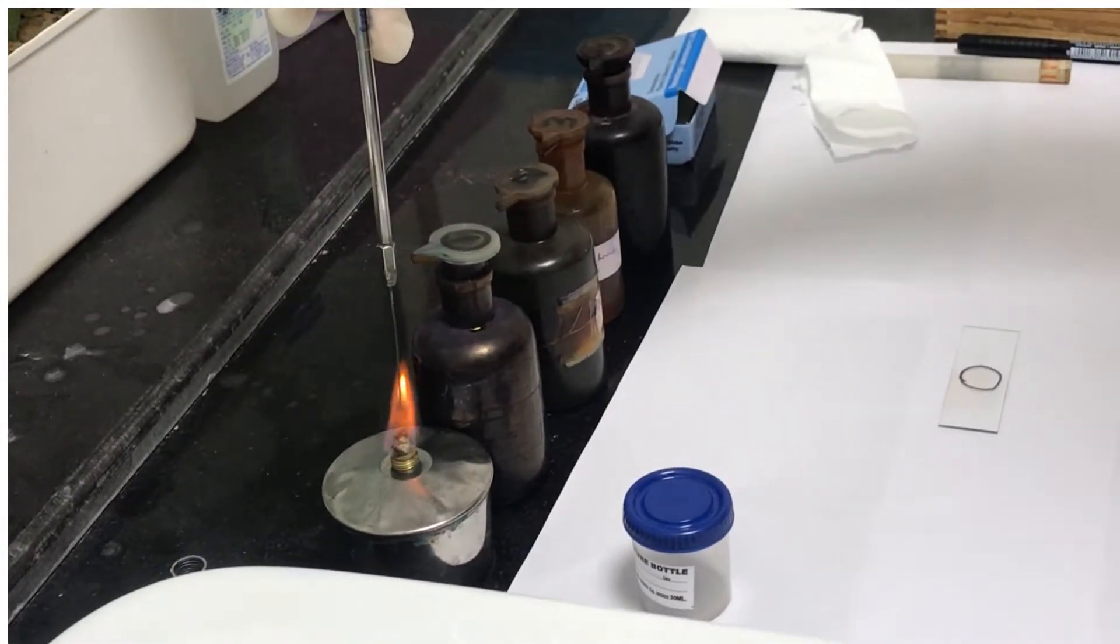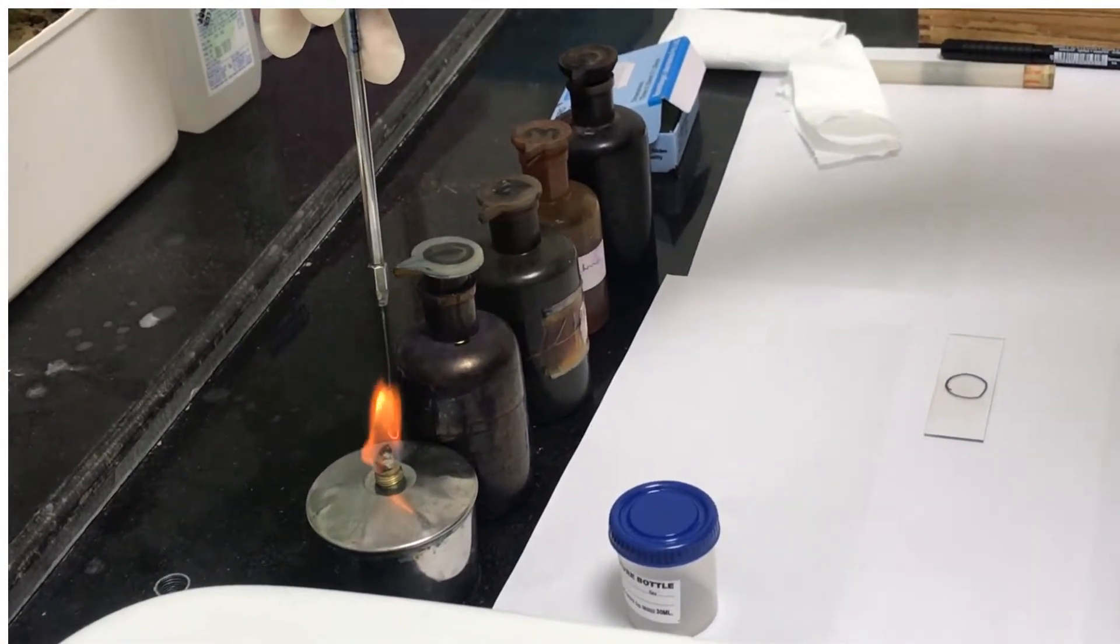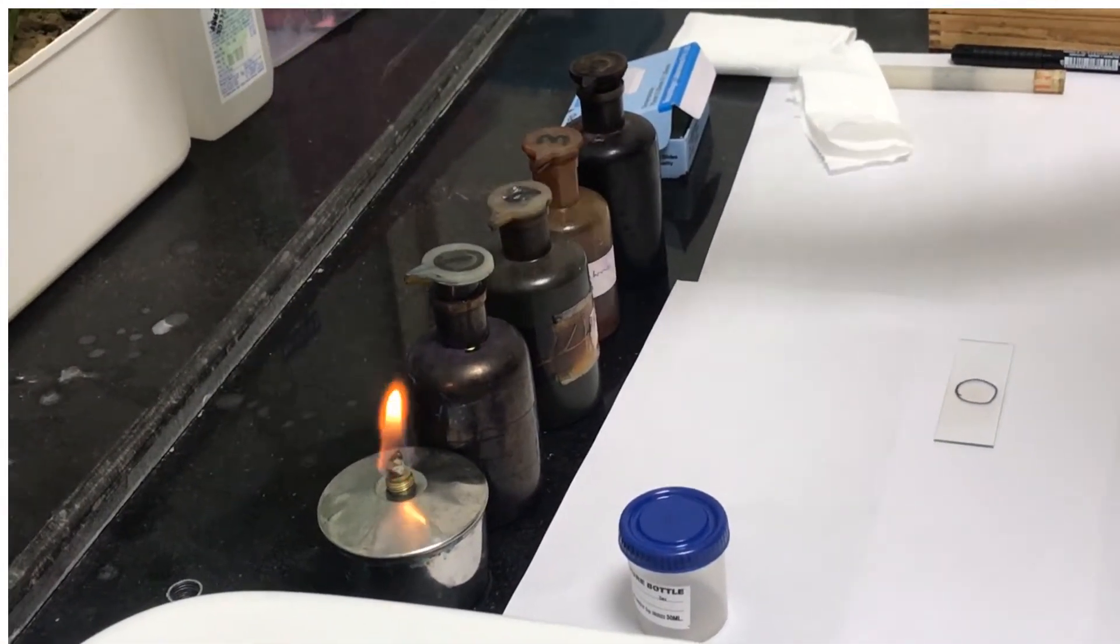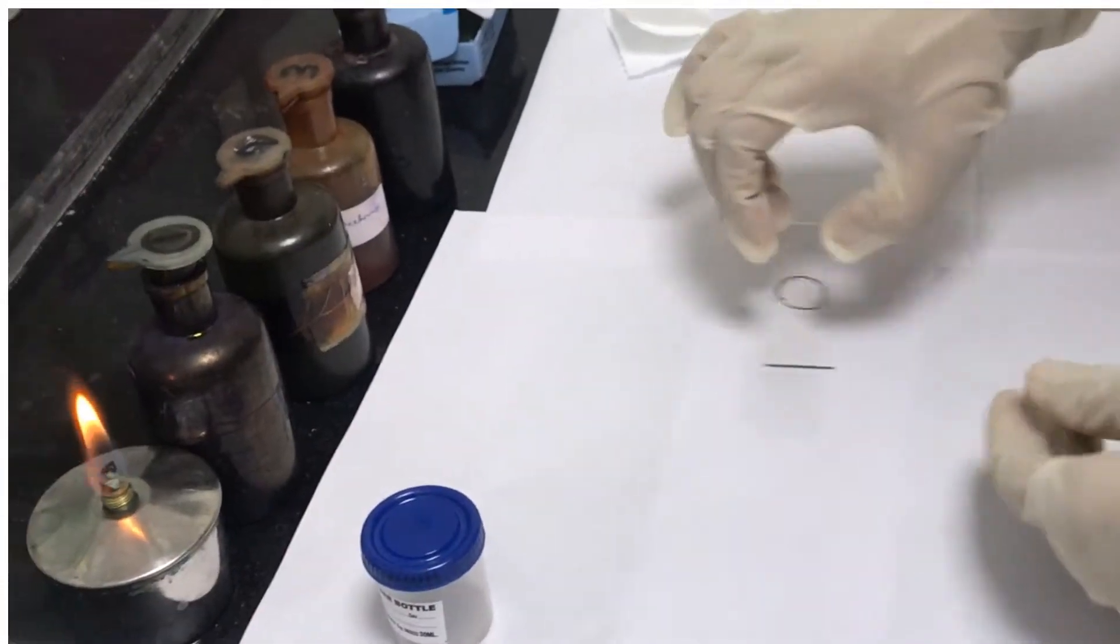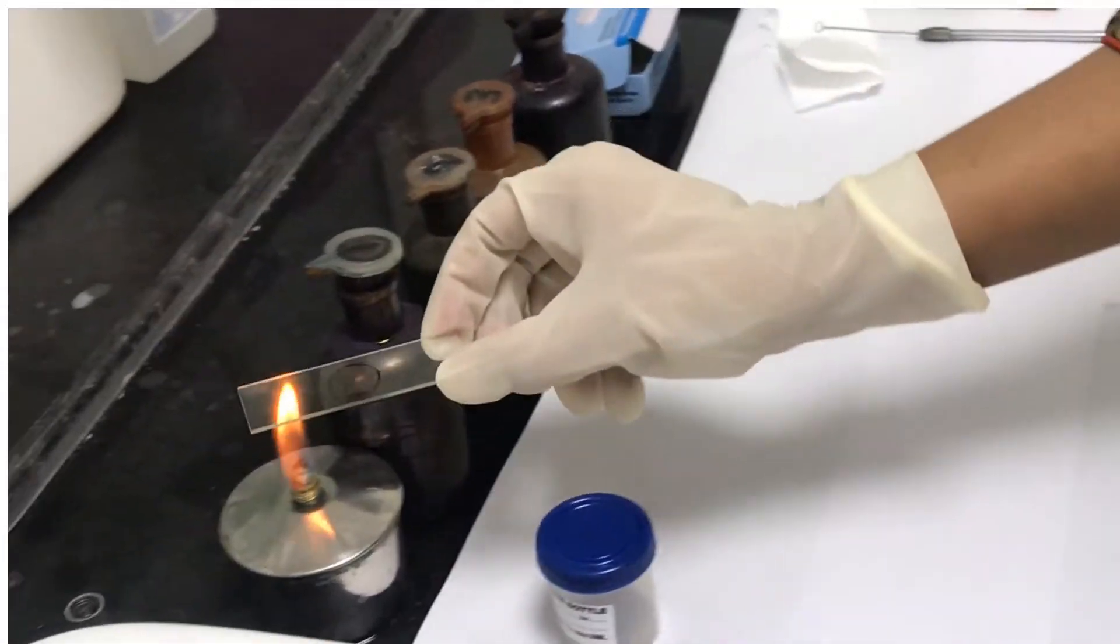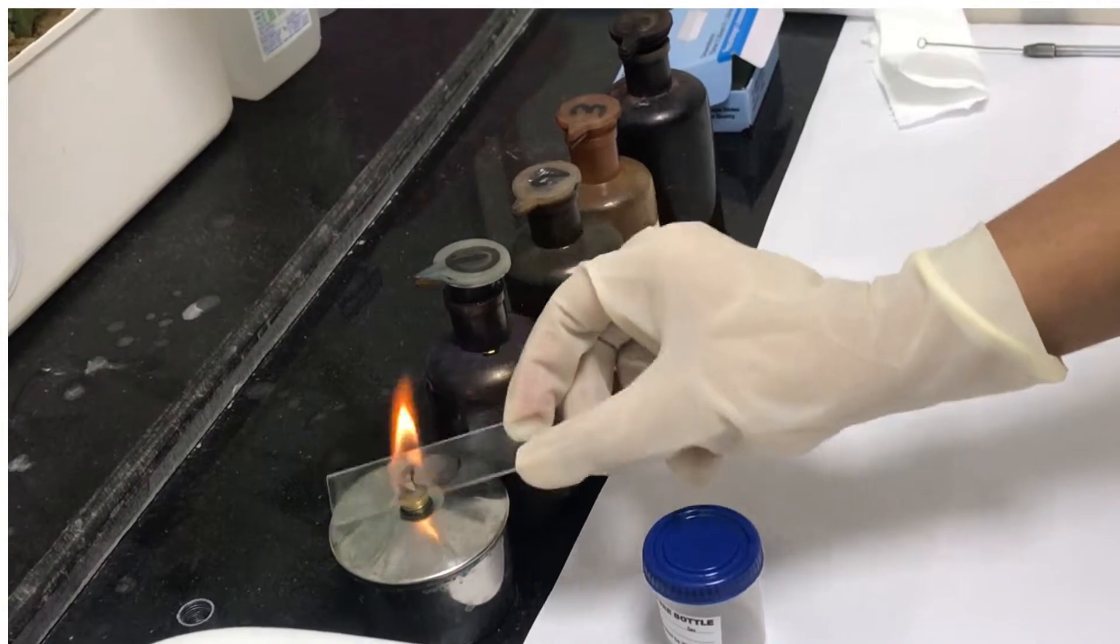Sterilize the inoculating loop again, meanwhile allow the smear to air dry. After the smear is air dried, hold the slide at one end and pass it through the Bunsen flame with smear side up. Do this two to three times.